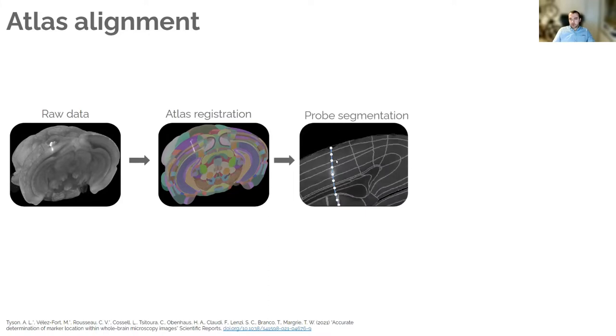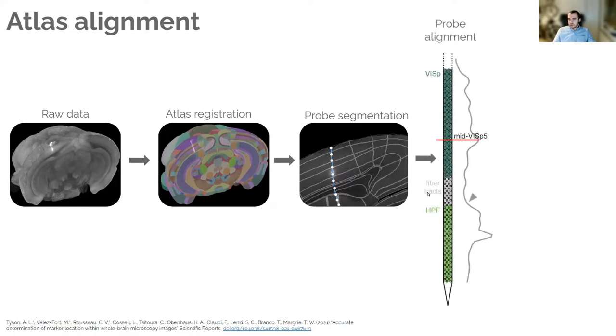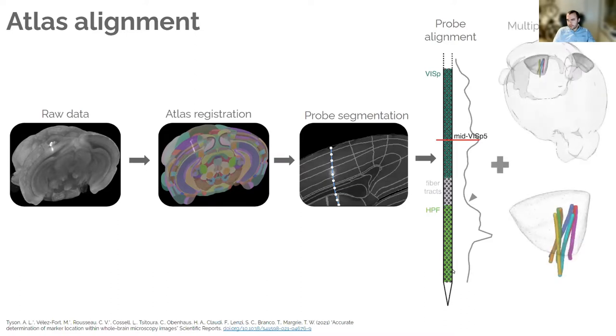Then you segment out your probe in some way. This might be an automatic approach or it might be manual, just like key points along the track. Then you can align your recordings to the anatomy. So in this schematic here from this probe, you can see that all these probe sites are in primary visual cortex and these are in the hippocampus. And then you can use these transforms to analyze and visualize all your probes together. Here we've got seven recordings from primary visual cortex from seven different animals that we've overlaid in a model of the Allen mouse brain.